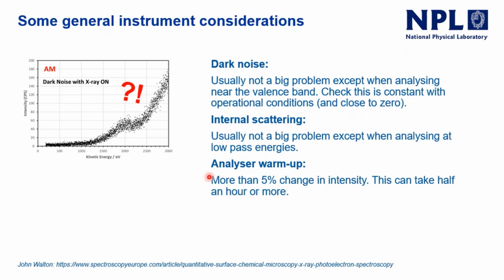And the other thing to be aware of is analyzer warm-up. It will take about half an hour for your instrument to get warm enough to give you a constant performance. So if you turn it on and do your transmission functions, by the time you get from the start to the end of the spectra, the whole thing's changed because it's warming up while you're doing the measurement. And the same if you want to do careful analytical work: warm the instrument up before you start.